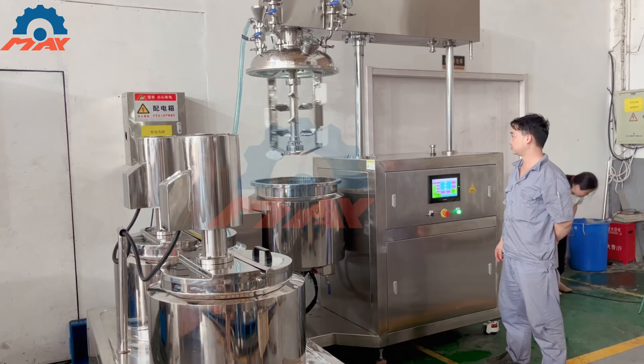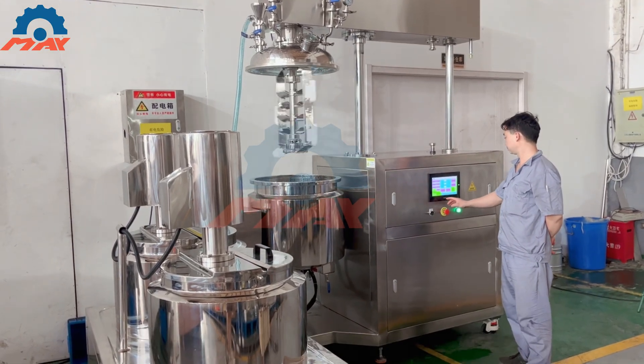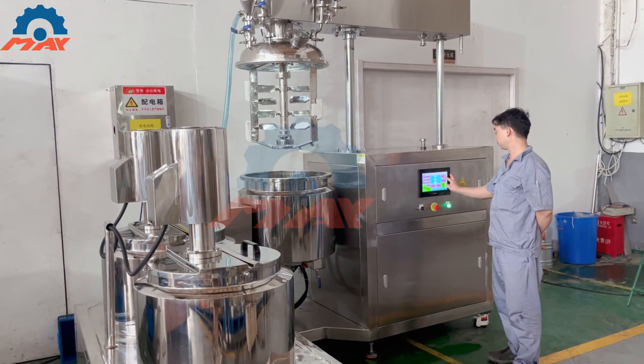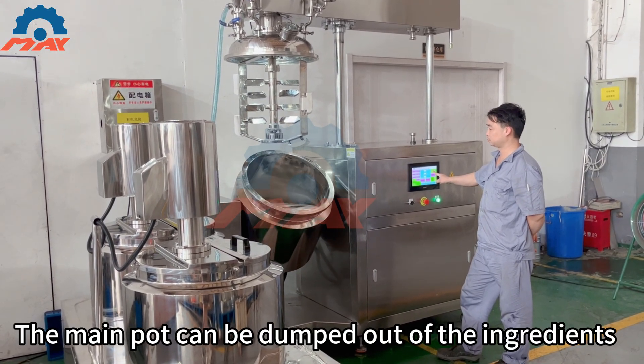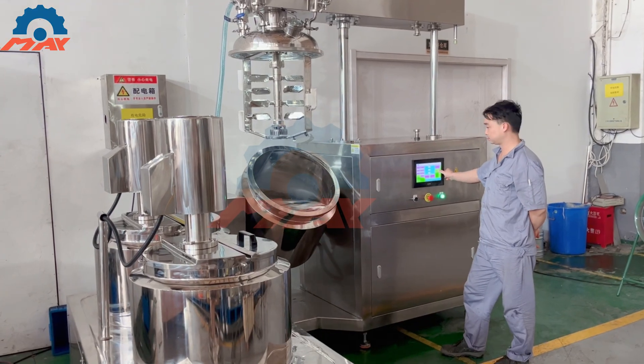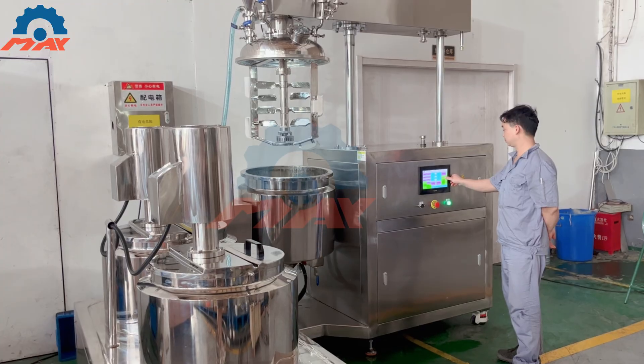Double jackets for heating and cooling, with different jacket designs available for steam and electric heating. Complete process of mixing, dispersing, emulsifying, homogenizing, vacuum, heating and cooling in one unit. Double temperature probes and controllers for electrical heating and main emulsification machine.